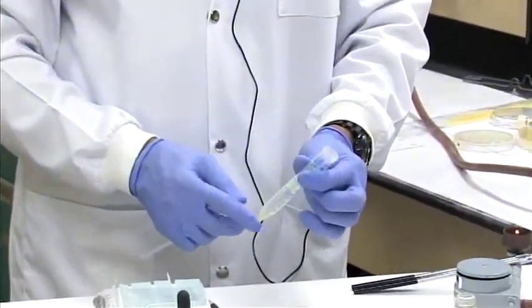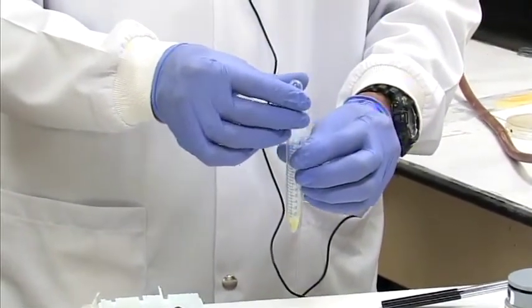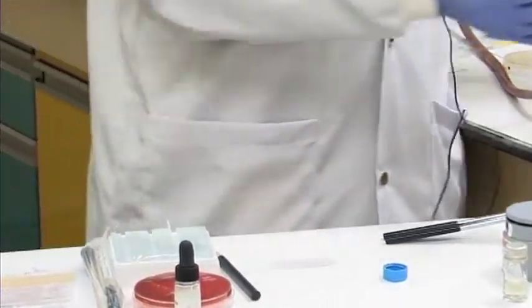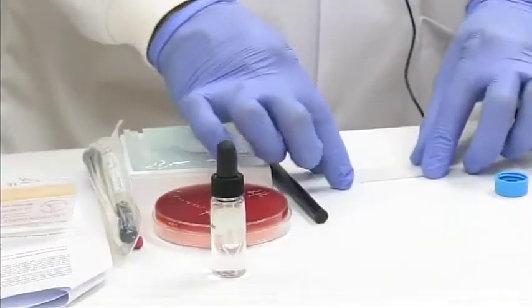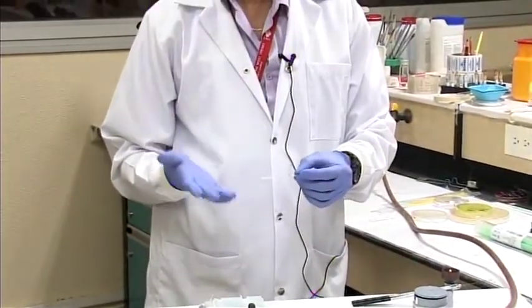It simply means mixing up the urine sample, using a pasteur pipette to remove a drop or two, and place it on a microscope slide where we're going to apply a cover slip or cover glass to it. Then we go to the microscope and examine it to look for cells, namely white cells, red cells, casts, bacteria. Sometimes you can see bacteria, you can see candida, you can even see trichomonas, etc. under this slide. So this is one form of a wet preparation.